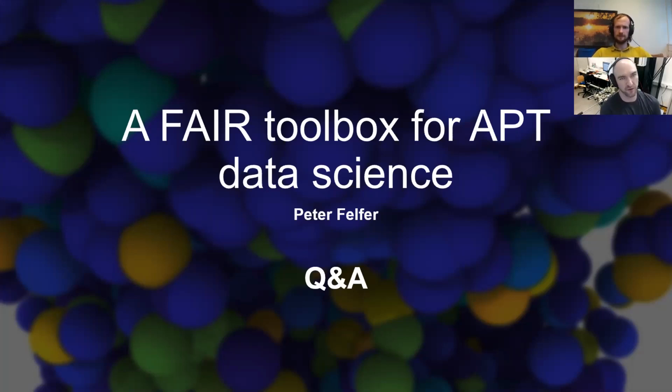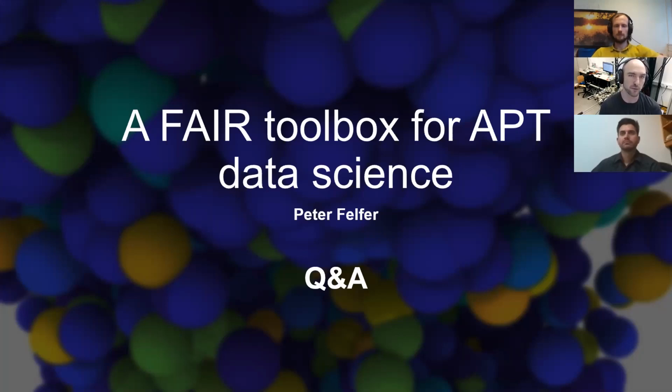Not the code that we've added to the GitHub, but the purpose of explicitly defining isotopes and everything in the mass spectrum, so defining all the ions in the mass spectrum, is actually explicitly made to deal with overlaps, yes. But what we call the concentration kernel for overlap solving is not yet pushed into the GitHub Atom Probe toolbox, but it will be in the coming months. And the good thing is you can use that concentration kernel for any dimensionality. You can use it for the entire data set, for a proxygram, for a 2D map, for voxelization, for whatever you like.